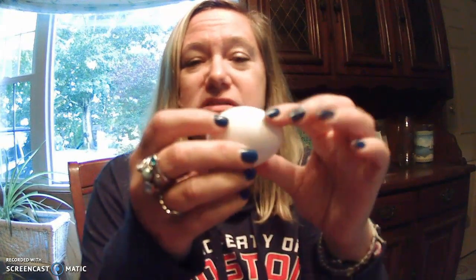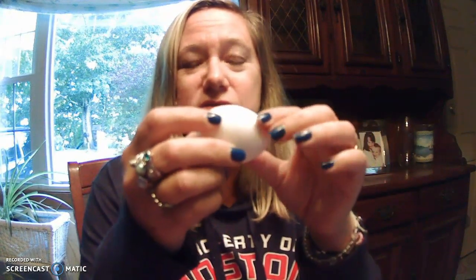Hi, guys. So here today I'm talking about the cell, and the main goal of this lab is cell diffusion, how materials get in and out of the cell. And we are demonstrating our cell with an egg. So we're going to do different things with this egg. We're going to put it in various materials, and we're going to see how the egg changes.